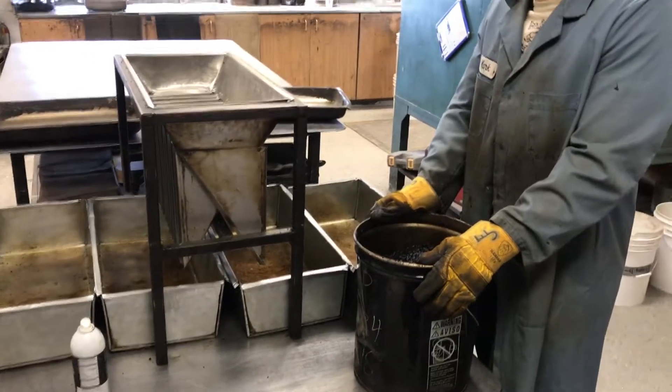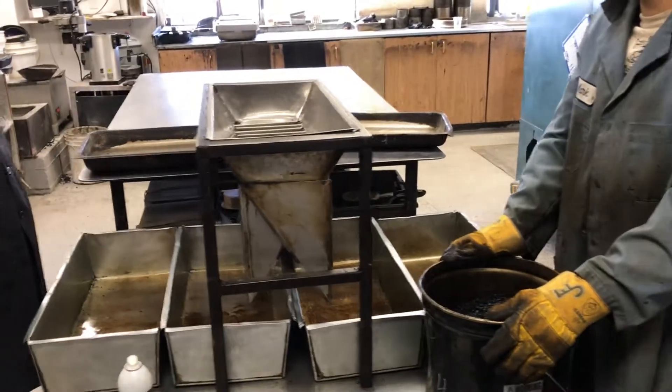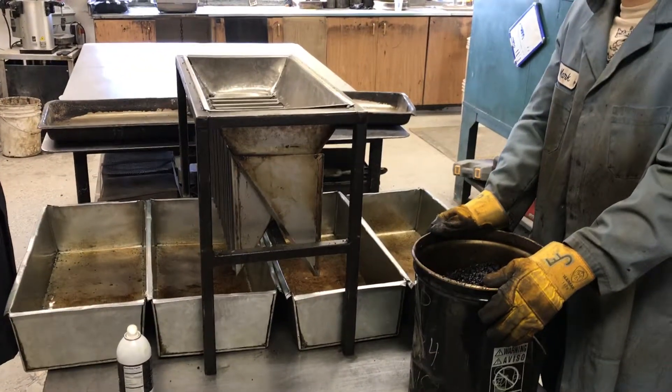We brought the material back into the lab after pulling a sample from the truck, and we're going to be splitting it out for burn-off, rices, and our gyratories.